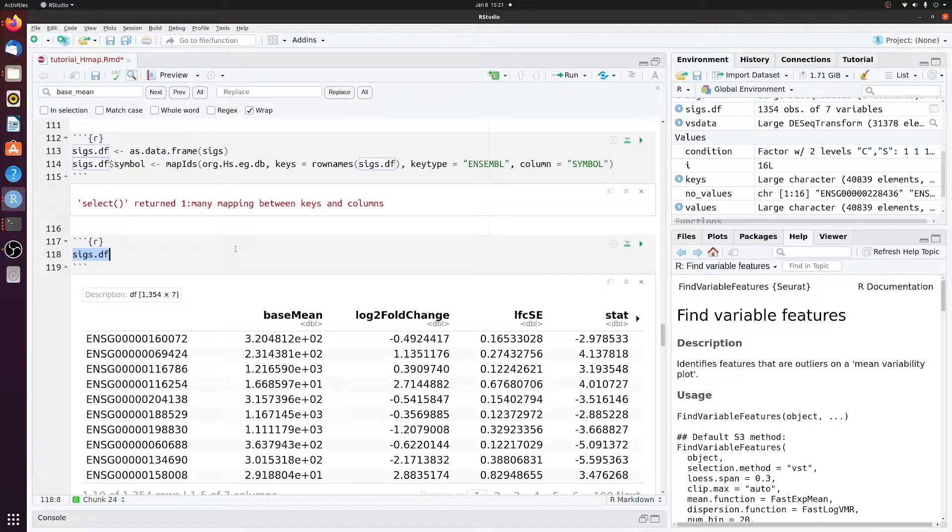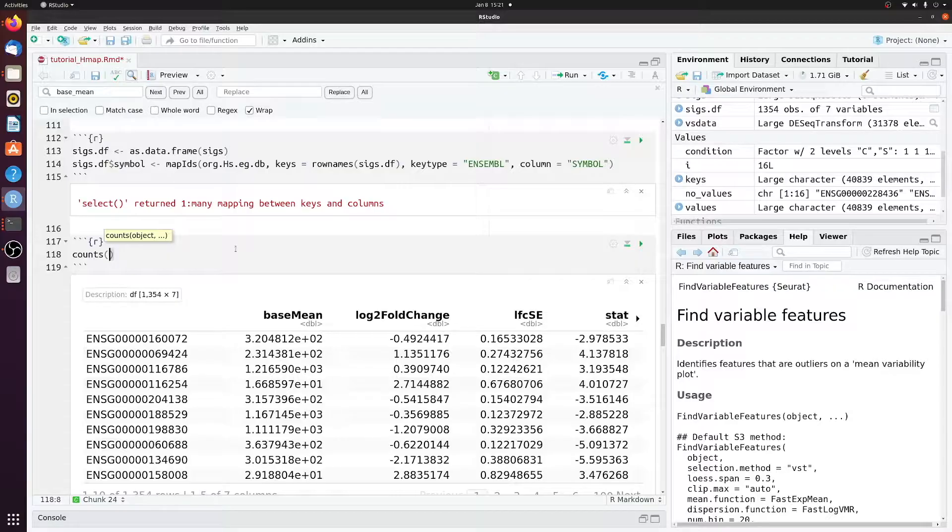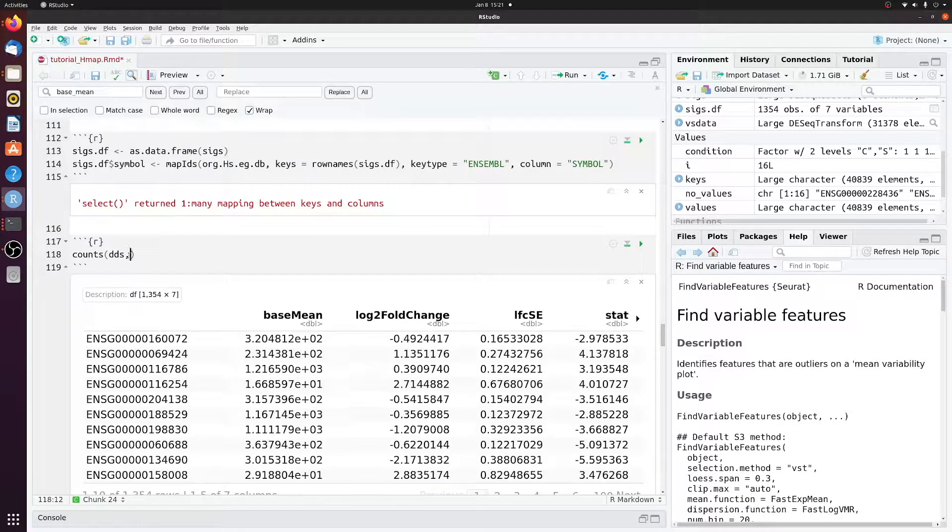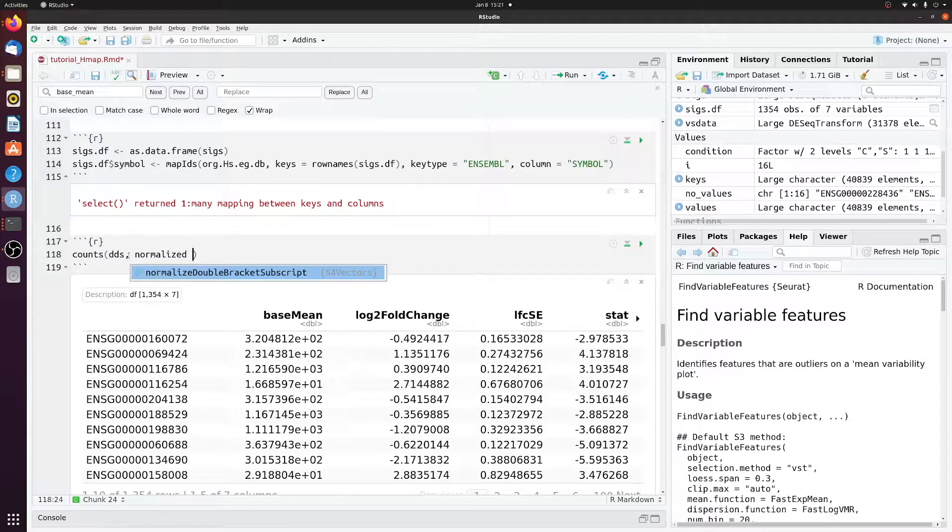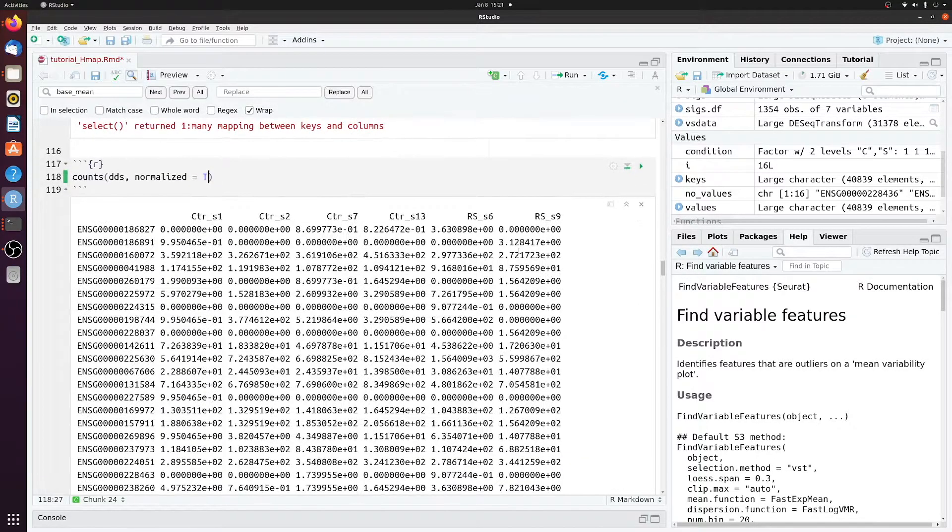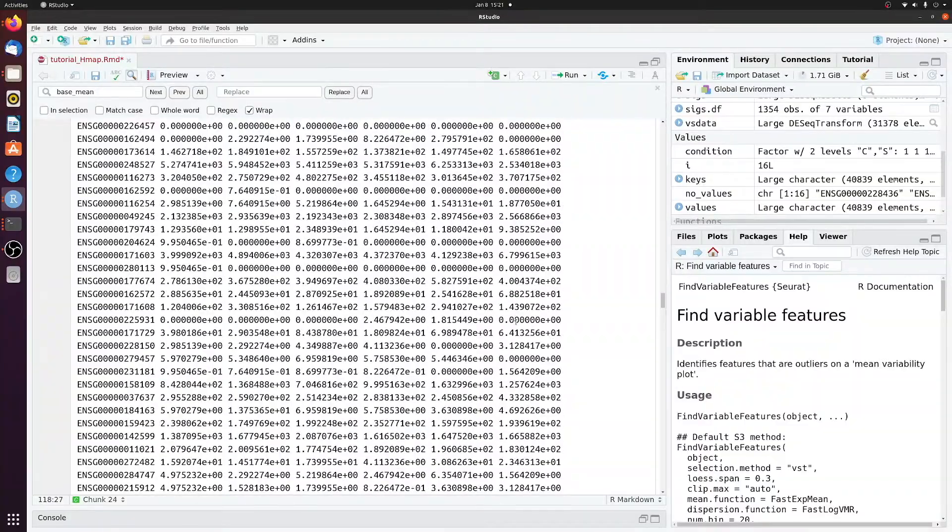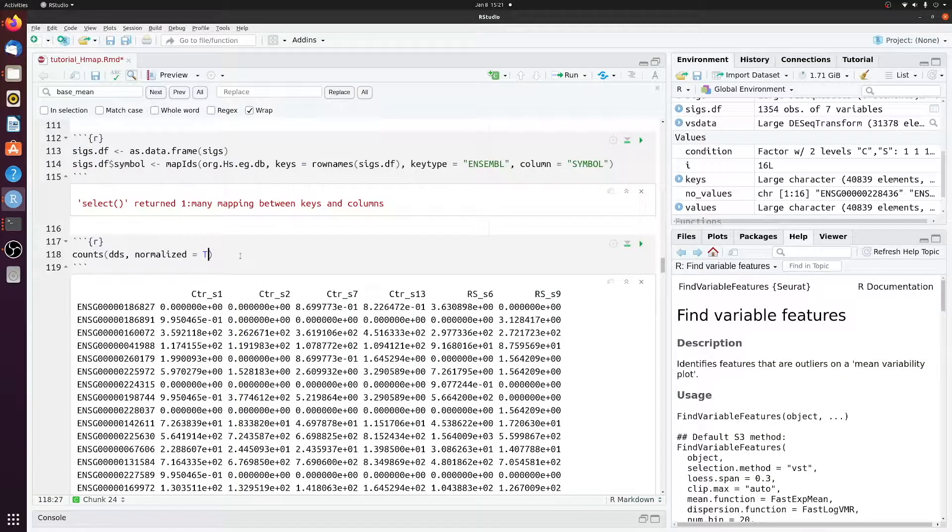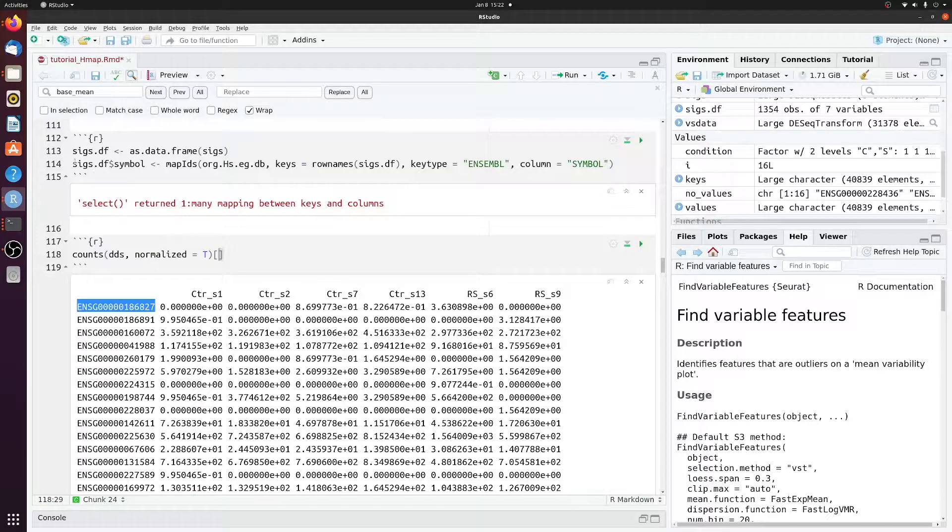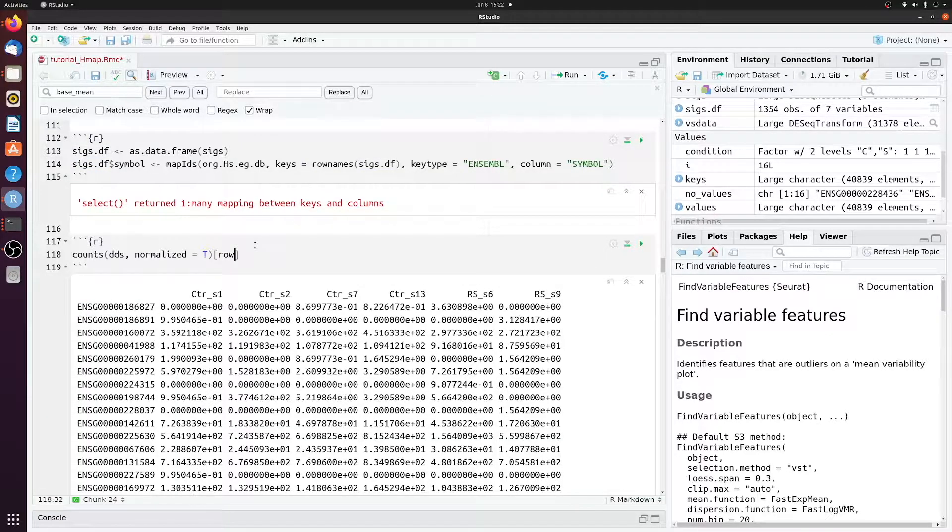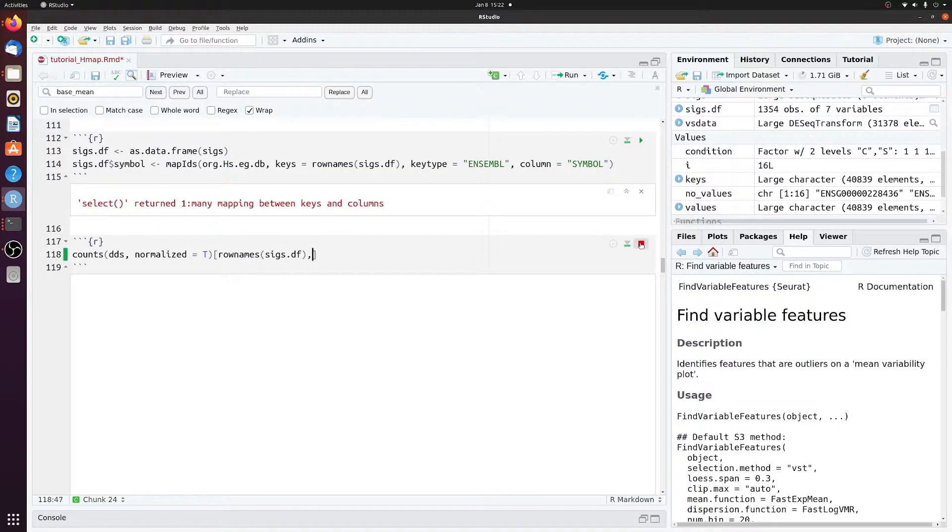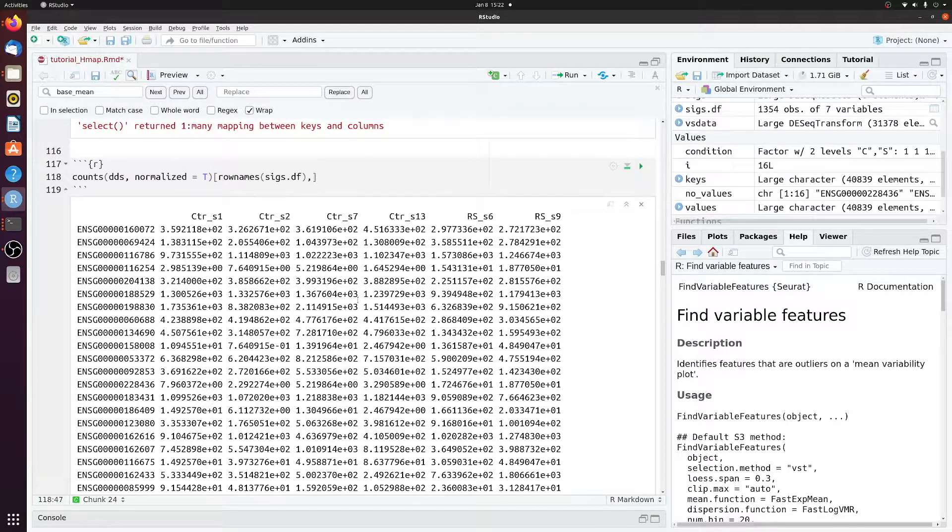Next, let's get some normalized counts from the DDS object. We're going to call it counts. And then we have the DDS object from our dseq analysis. And we want normalized equals to true. So now we have this matrix of all the genes in the DDS object. So all 30,000 or so entries. But we only want the counts with matching ensemble IDs to our significant data frame. So we'll just say row names SIGsDF. And now we have a matrix of only the 1300 genes.